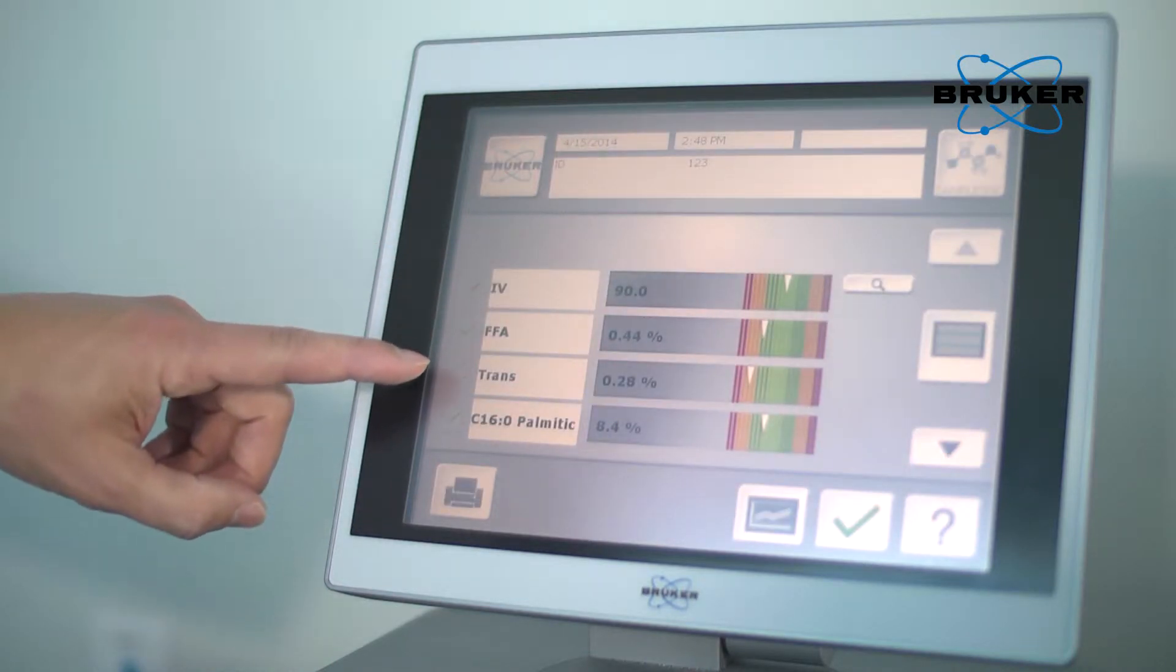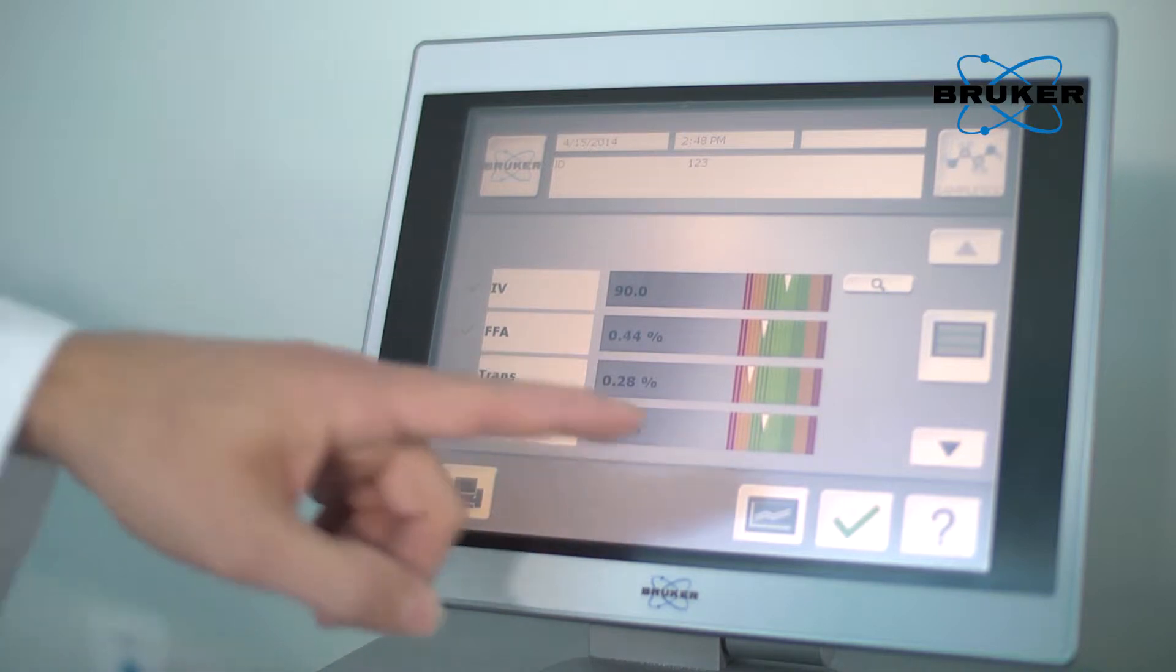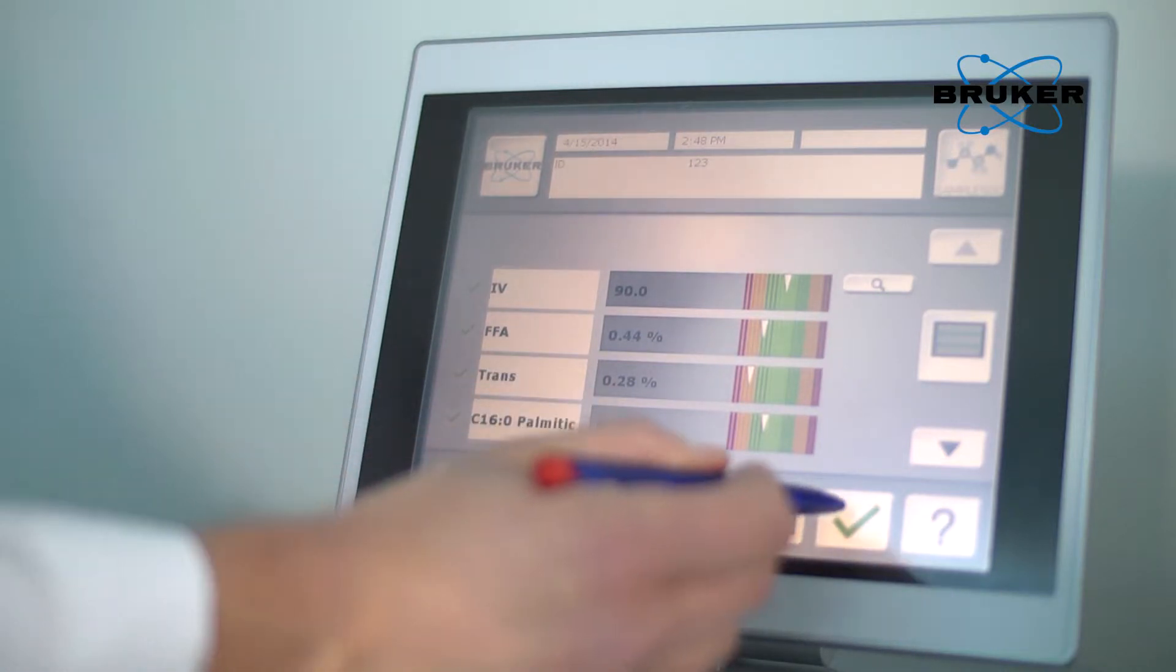One last push of a button, if required, the stored result can be exported by USB at any time.